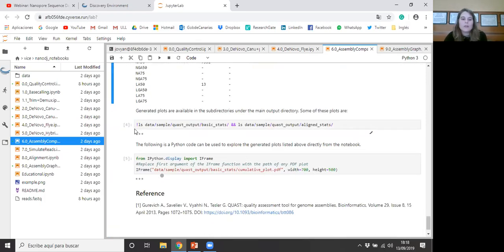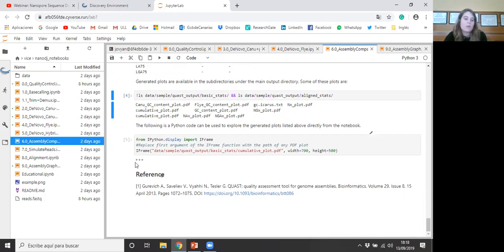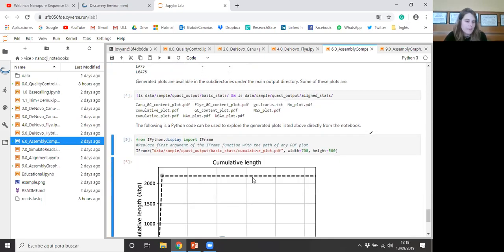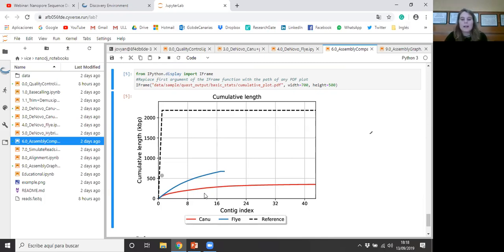We can also obtain, with this software, different plots. One example of this plot is the cumulative length plot. In this plot it represents the number of contigs and the cumulative length. In this case we can see the result for the Canu assembler, the Flye assembler, and the reference genome.